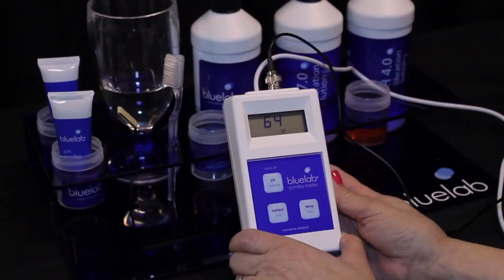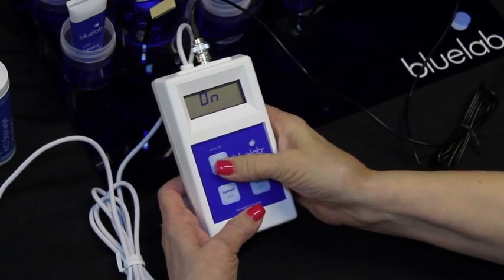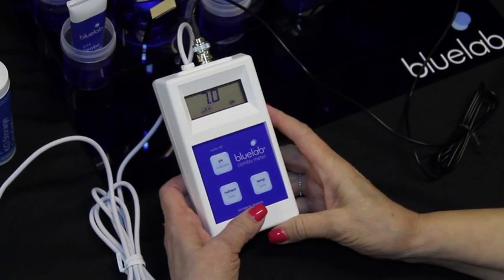The combo meter automatically turns off after four minutes and there is no off button. If the meter turns off before a reading is taken, press any button to turn it back on.